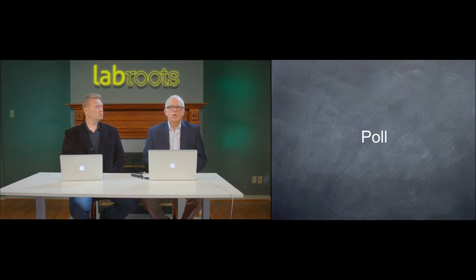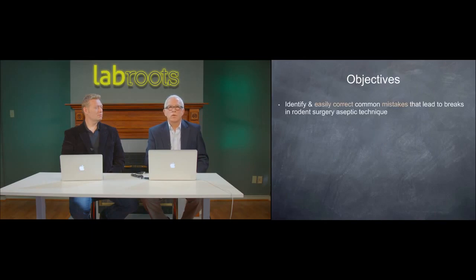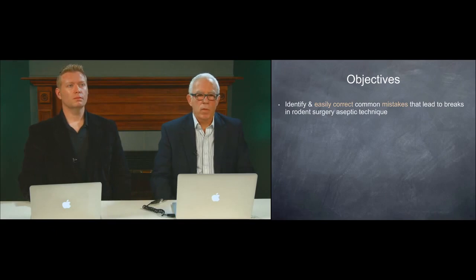I have for years looked on the internet for materials that help me illustrate aseptic technique in rodents and an easy way to do it. And again, I was frustrated with my findings. So today, our objectives will be to identify and easily correct common mistakes that lead to breaks in rodent surgery aseptic technique.